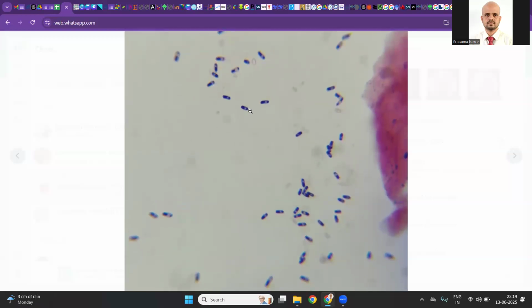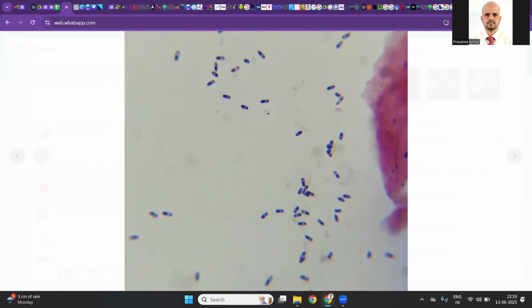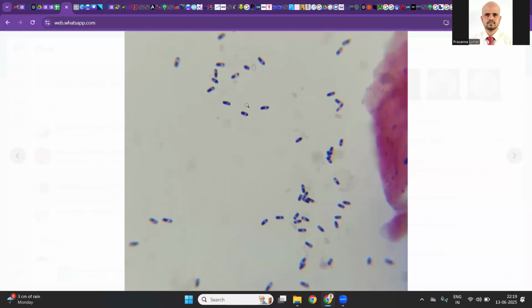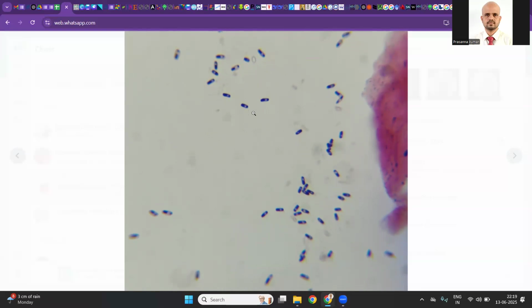Why does gram staining sometimes reveal endospores? It is possible. The crystal violet is actually staining. This is a gram-positive bacteria. The peptidoglycan around the cell wall has been stained. When they are producing endospores, the endospore bulges. So the cell wall immediately after the endospore wall is actually very thin. They will have a thin peptidoglycan layer, which usually results in less absorption of dye. So you will see in the Bacillus, the center portion is oval and the polar regions are stained. They are not actually designed to specifically stain endospores, but they can sometimes indirectly visualize endospores; endospores can be visualized using gram staining like this.